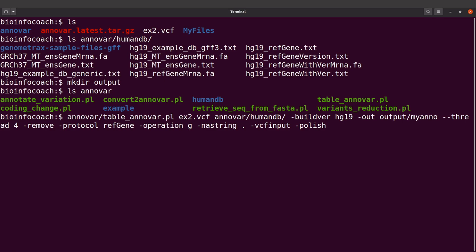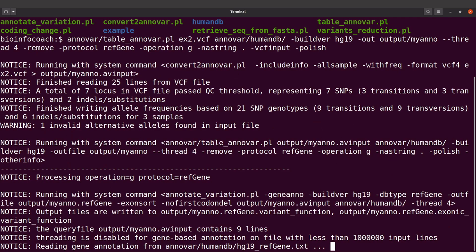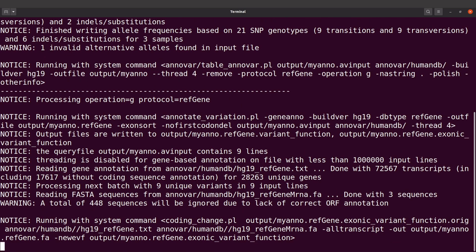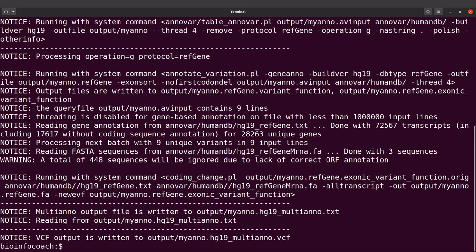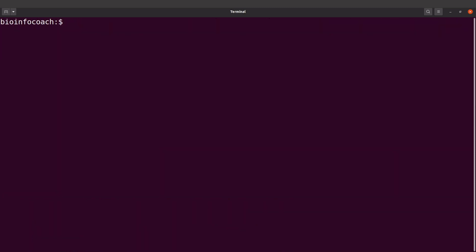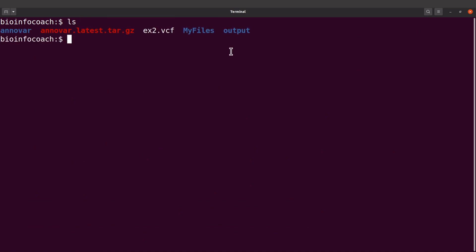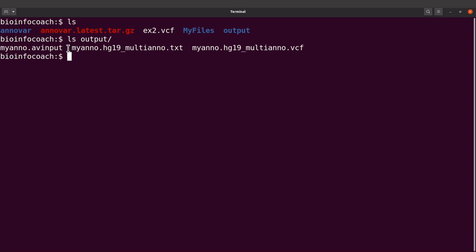We have everything we need, so now we can execute this command to annotate the variants. ANOVA has started — let's wait for it to complete the annotation. Annotation has been done, so let's take a look at the outputs. I'll do 'ls outputs' and I will see the output files there.